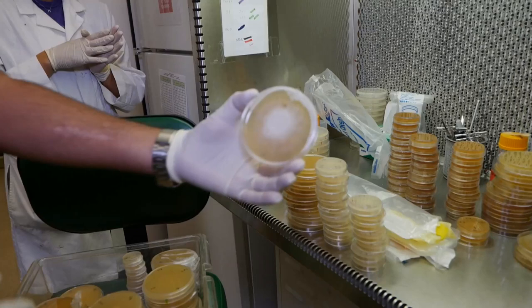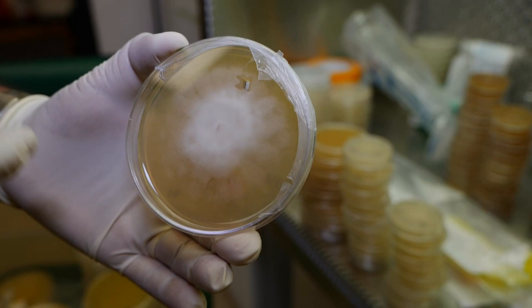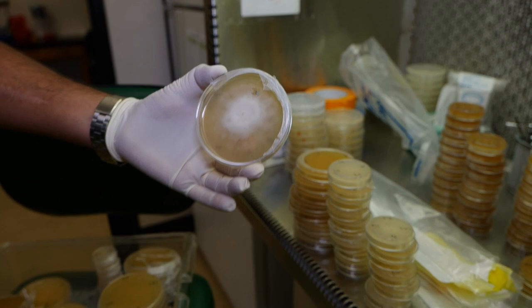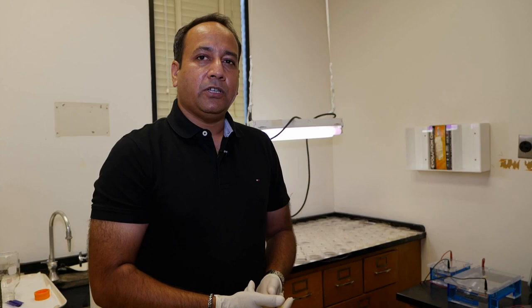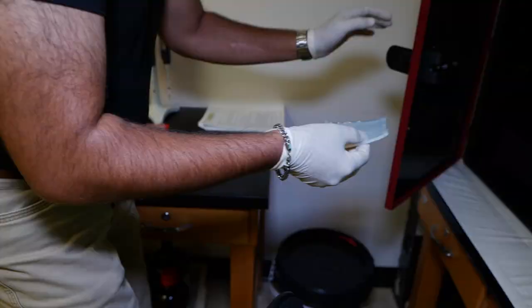This is where we culture our pathogens. You can see here some plates that have produced the mycelium that we're looking for or the fungal pathogen. This is actually not a fungal pathogen, it's fungal-like microorganism, which is phytophthora. It's basically known as a water mold.